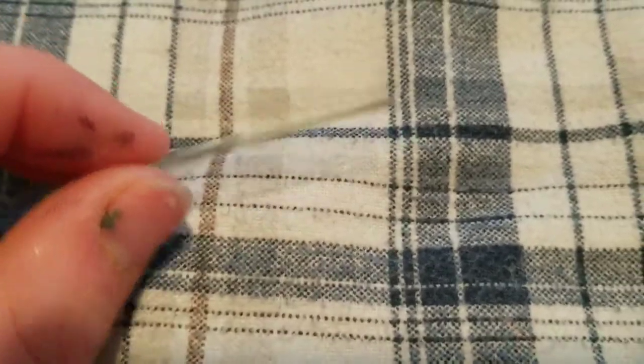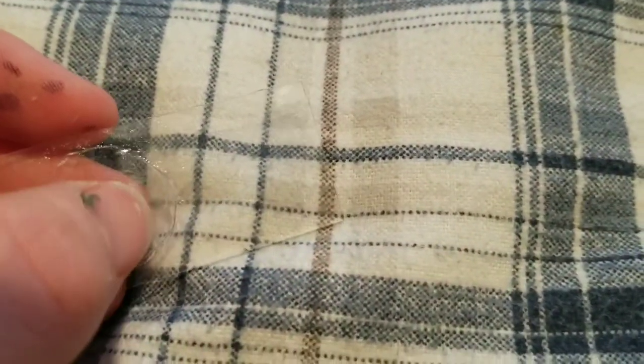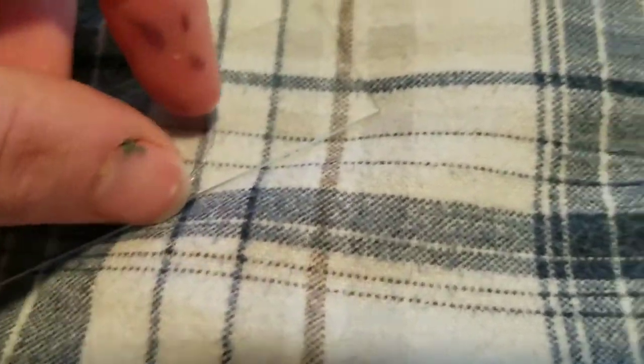What I'm going to show you next is the fact that I have finally successfully viewed the bacteria that I grew in my petri dish under the microscope, which I never really thought I would succeed at. So this is the slide, as you can see, unstained. I used a plastic cover slip, but this plastic is so thin that it only slightly undoes the polarization effect.